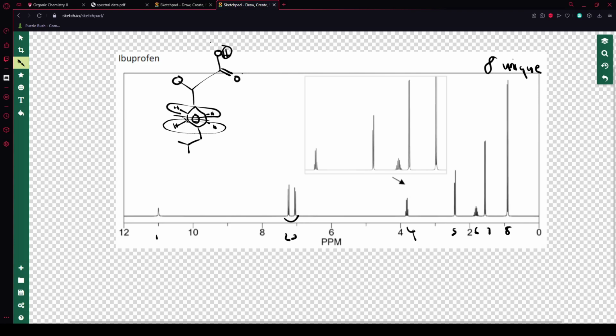And so I'm running out of time here, but basically these are just going to fill in the rest of these alkanes, and probably the most important one you want to see here is this one with a ton of peaks, and we are going to say that one is probably right here, because this is attached to 1, 2, 3, 4, 5, 6, 7, 8 hydrogens, so it's going to have a ton of peaks.